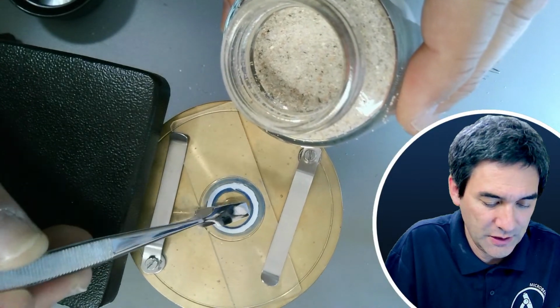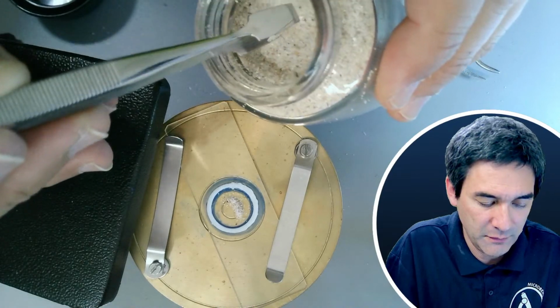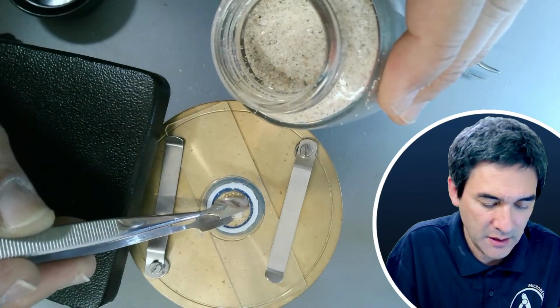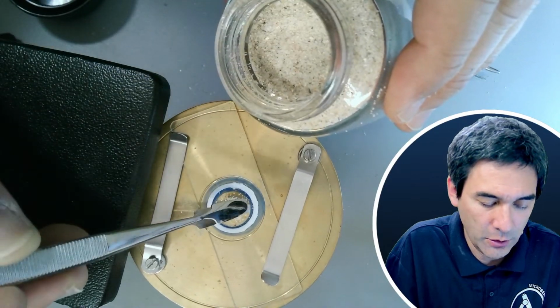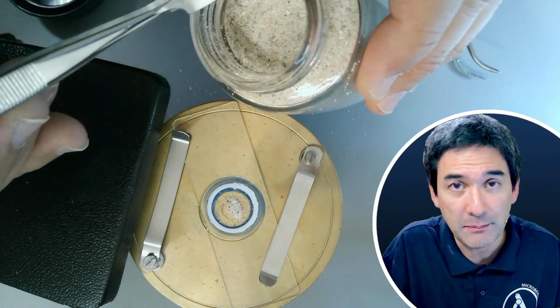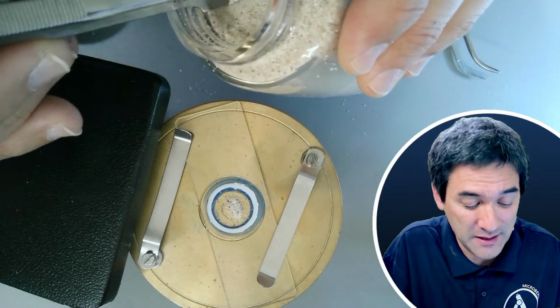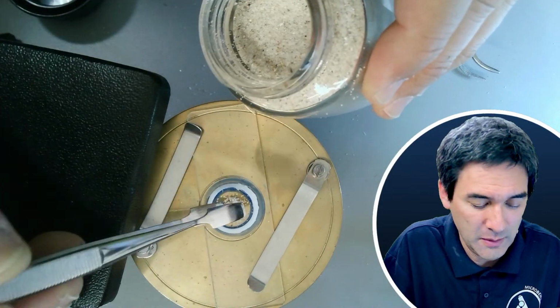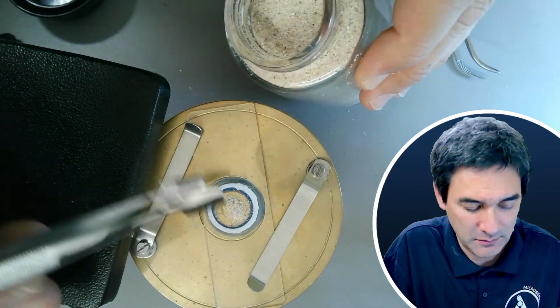Of course, this principle can also be used for micro aquariums. In other words, if you have slightly larger organisms like water fleas, for example, water crustaceans and so on, and you do not want to crush them with a cover glass, then you might also consider these spacer rings. In the past, what do you mean in the past?